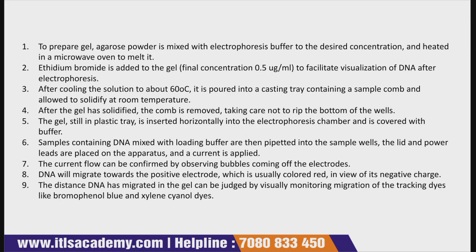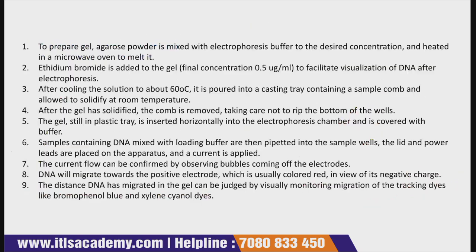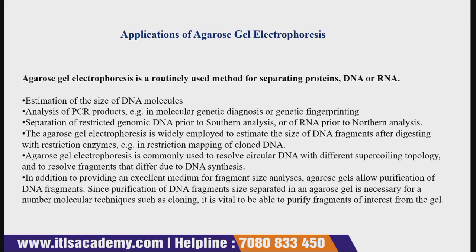In view of this negative charge, the distance the DNA has migrated in the gel can be judged by visually monitoring the migration of tracking dyes, like bromophenol blue and xylene cyanol dye. So this is how the electrophoresis of agarose gel takes place, and these are the steps of how this experiment is performed. Now let's quickly move to the applications of agarose gel electrophoresis.